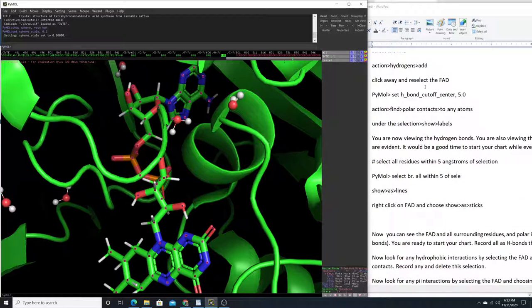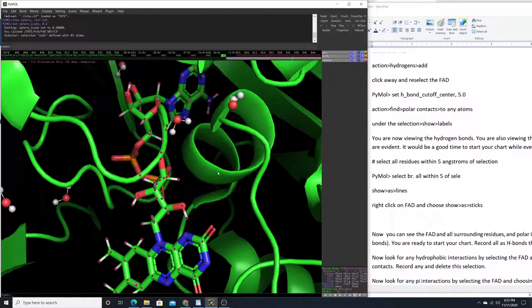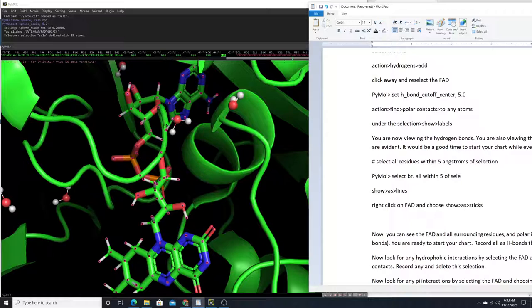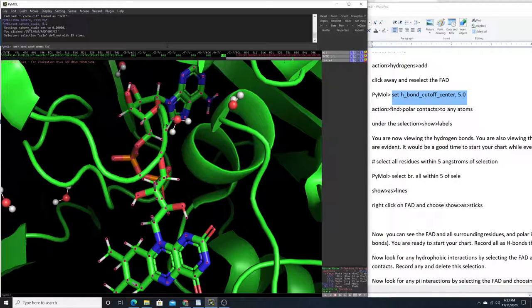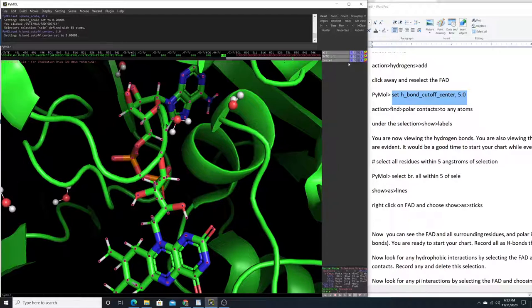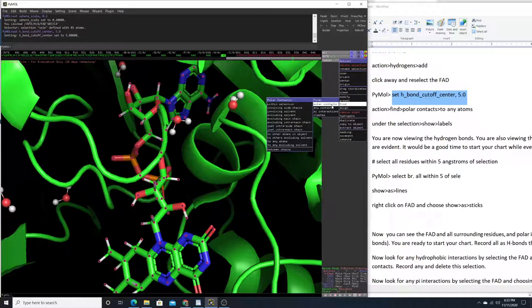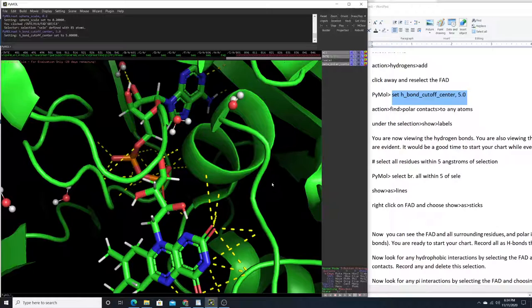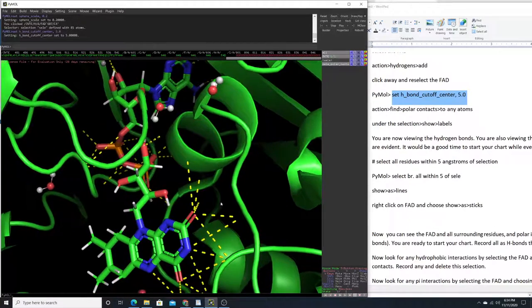Click away and select the FAD again — we're doing that so we also capture the hydrogens we just added. Now we want to set the hydrogen bond cutoff to five angstroms to find our hydrogen bonds. Then choose Action > Find Polar Contacts > To Any Atoms. Notice we have the FAD selected, and we're choosing Action > Find Polar Contacts > To Any Atoms.